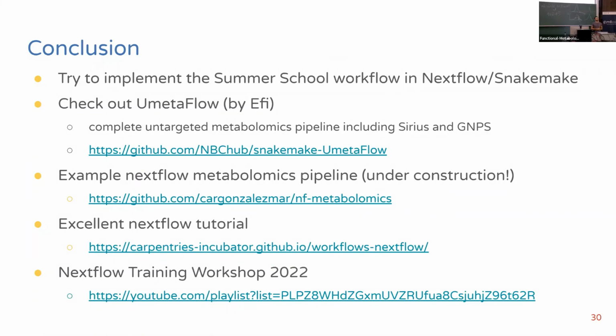But then it's a decision on a lab level, not on the individual level. It's on the researcher level as well if you do the analysis. It seems easily customizable, right? True, you can change parameters. Exactly. Pretty much like in MZmine, where we put everything in batch mode, here you can put everything, but with different tools, in a pipeline.